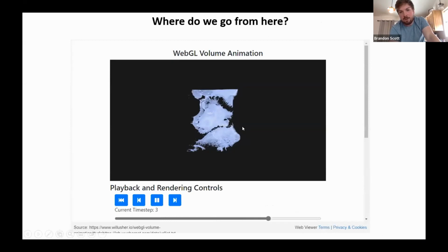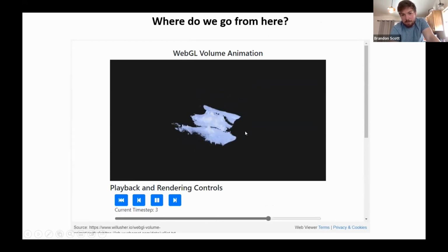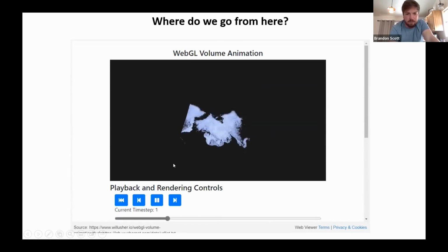Well, what we can do is something that I think is very, very exciting. And in here, we're working to build a volumetric viewer for full volumetric data, full volumetric movies. And so again, if I had the right mouse, I could zoom in and show you these data up close, but these are full, the intensity values that you can slide and change their view in real time, again, on something as stupid as a cell phone.